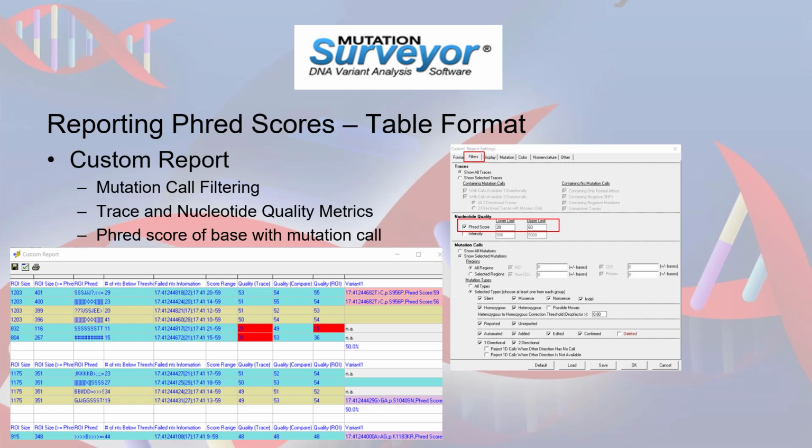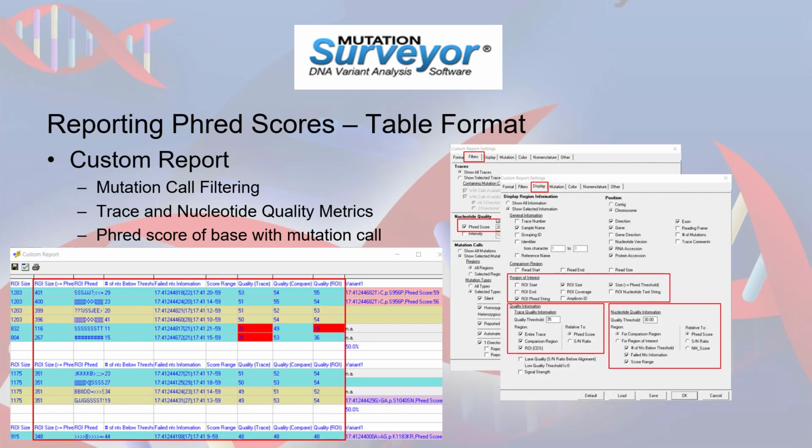The Filters tab of the report settings provides an option to filter mutation calls at locations where the Phred score is outside of a user-defined range. Settings on the Display tab can be used to look at nucleotide, regional, and overall trace quality. If the GenBank file loaded into the project defines specific regions of interest, settings exist in the Region of Interest section to display Phred score information relative to those regions for each sample.